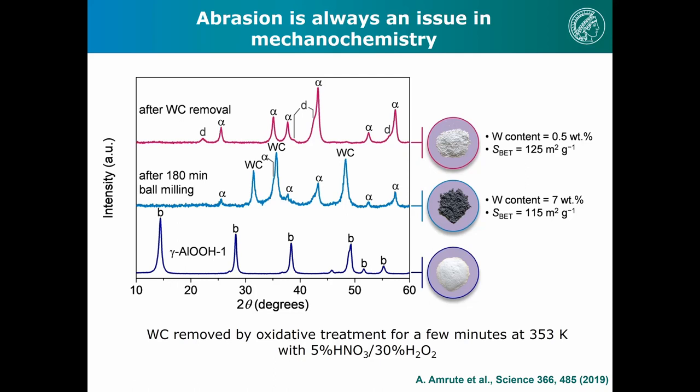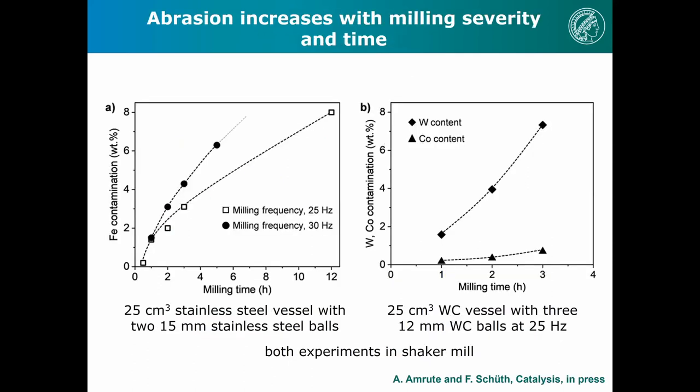The problem is the scaling still. We haven't been able to scale it up to the 100 gram scale because, if we do that with a ceramic vessel where we don't have the contamination, the ceramic breaks after 5 hours. We have to develop something. There is actually big industrial interest from a company in France, so we continue working on it.